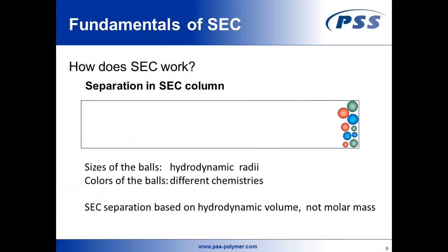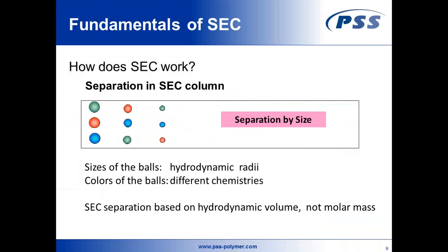I briefly want to introduce you to GPC at all. So I mentioned before, GPC is a method that separates samples, polymers, proteins, however you want to call it, according to size. The separation of SEC is indicated here in this small video. You see that the separation takes place inside of a column indicated with the frame here.